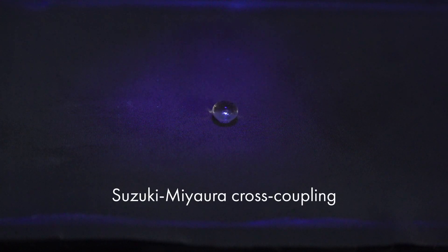Our platform also allows chemical experiments. Here, Suzuki-Miyaura cross-coupling, an essential carbon-carbon method in organic synthesis is shown.